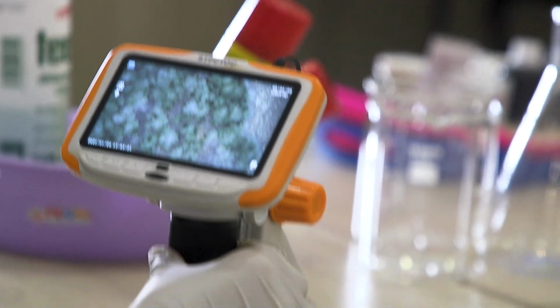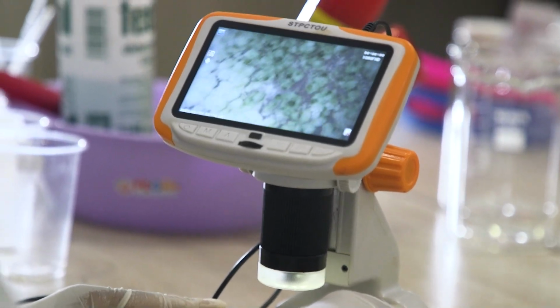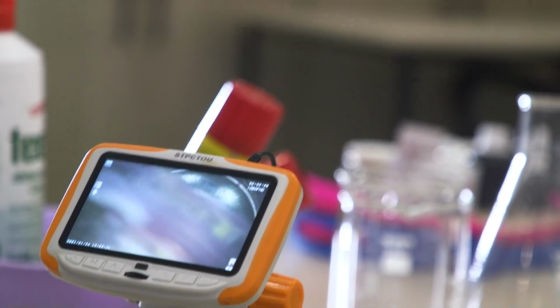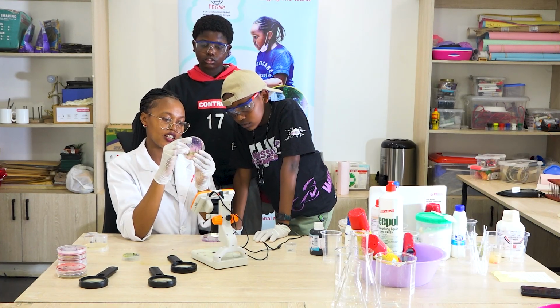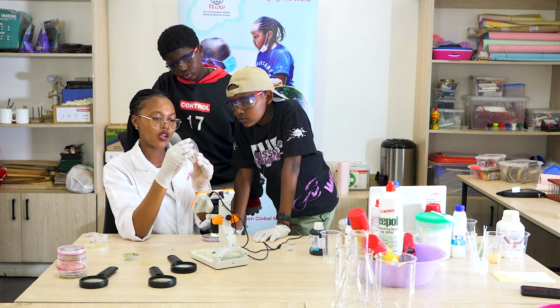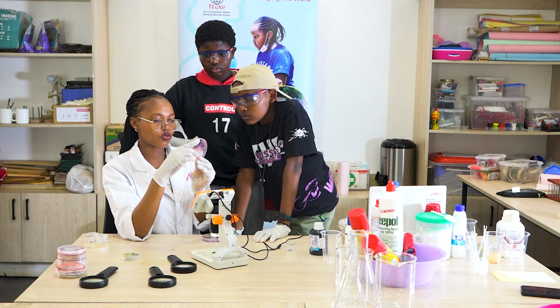Where does this fungus get its food from? Pink stuff underneath. What is it called? It's called agar. So this is where I culture my fungus or my bacteria from. It contains nutrients, everything that the fungus requires to grow.